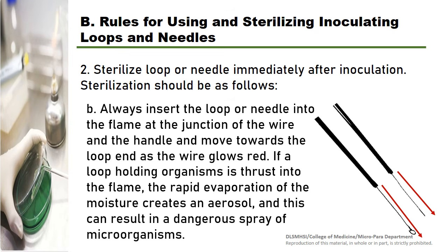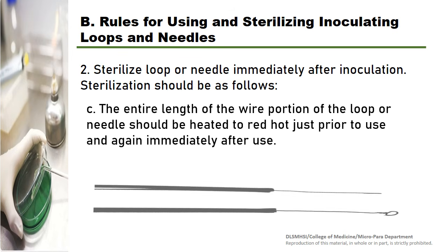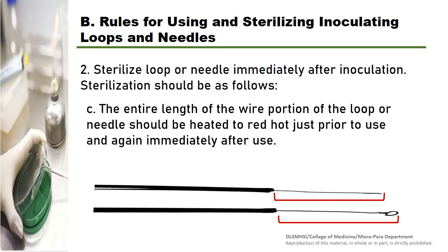If a loop holding organisms is thrust into the flame, the rapid evaporation of the moisture creates an aerosol, and this can result in a dangerous spray of microorganisms. Ensure that the entire wire portion of your loop is heated prior to use and again immediately after use.